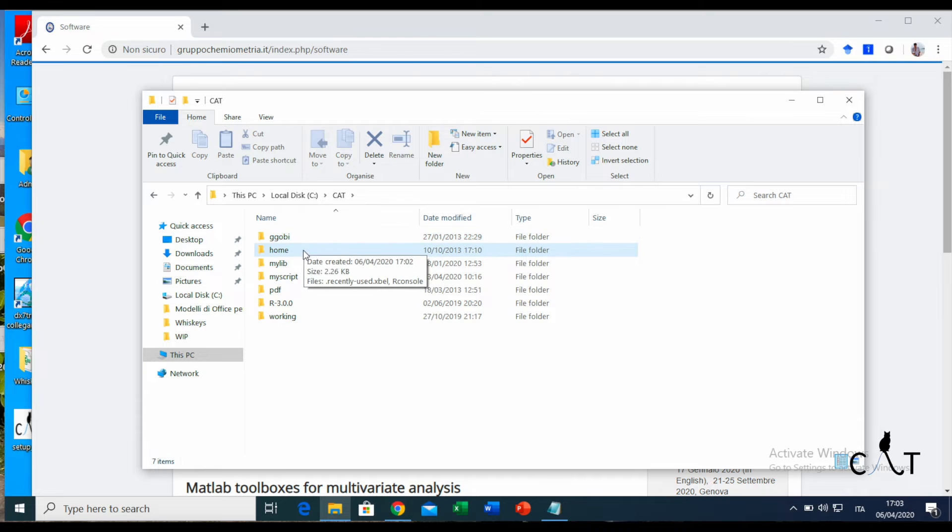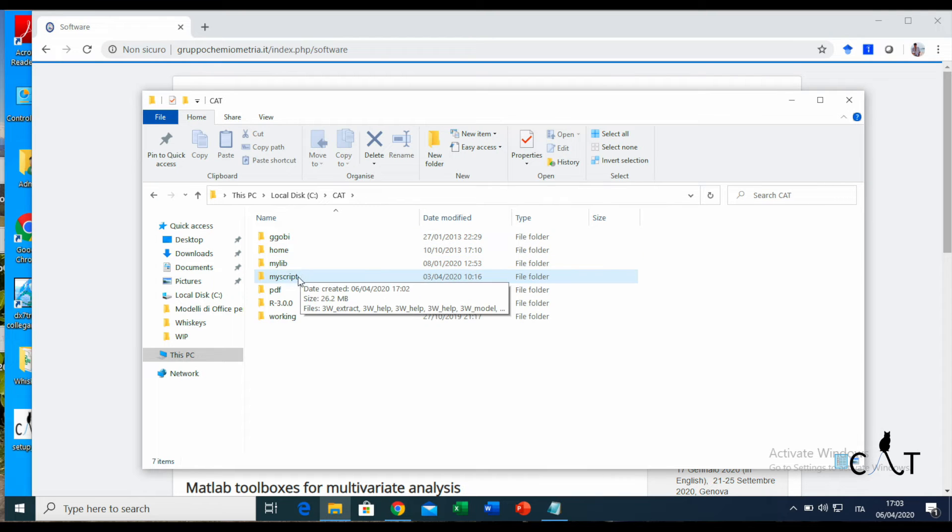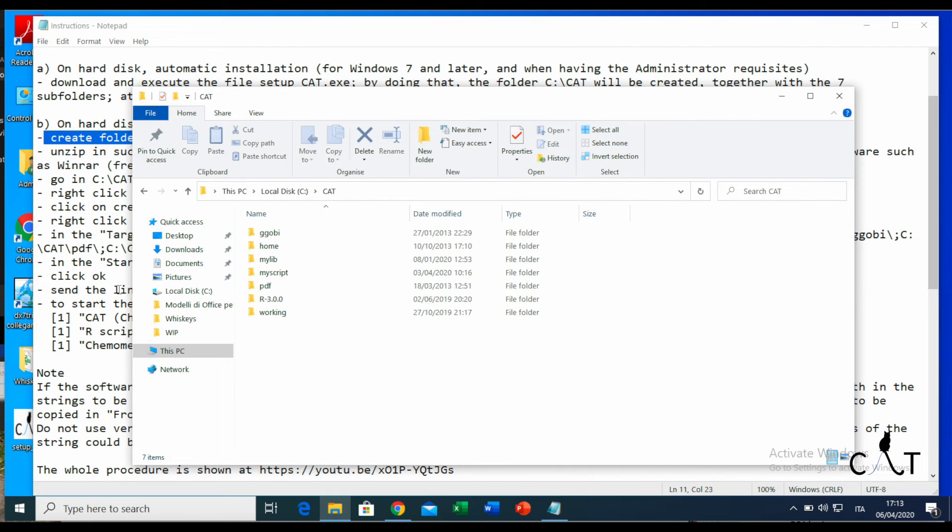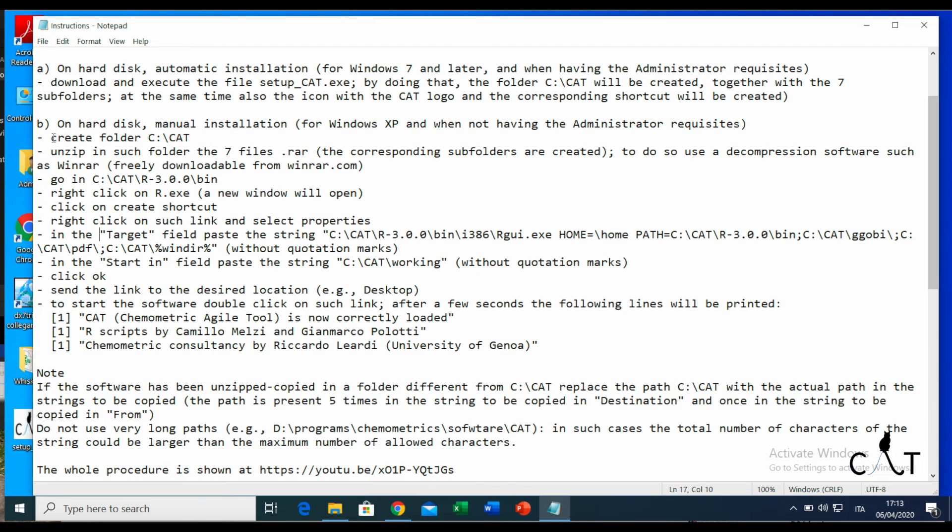Here we are on the local disk now. We go to CAT and check. As you can see, we have all the folders.